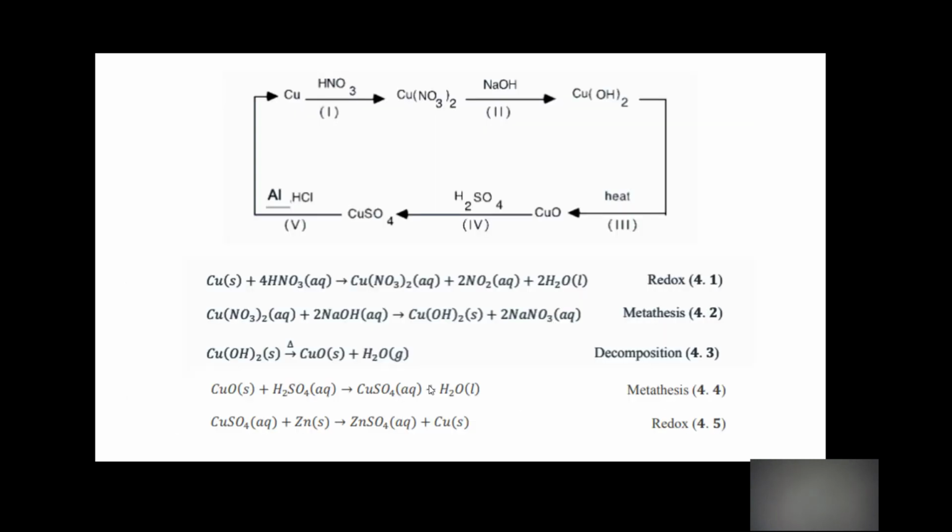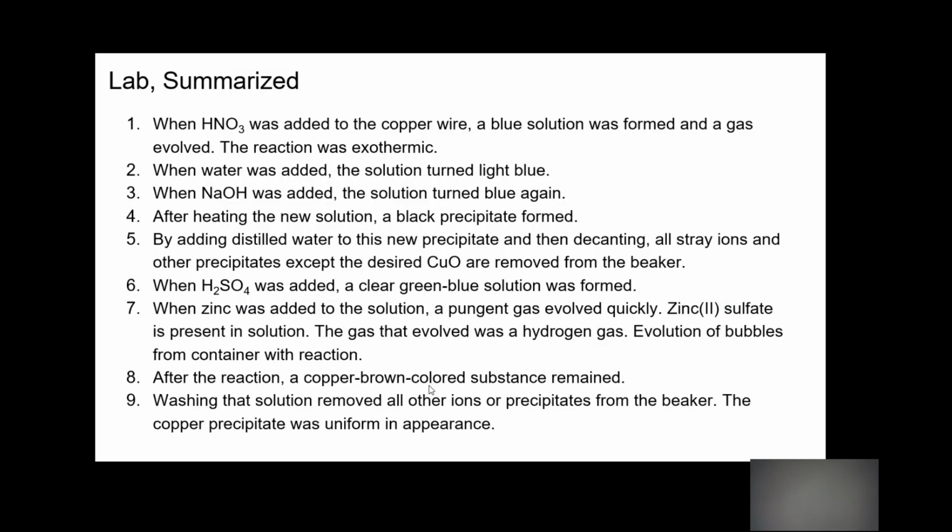This is where you step in and you have to really pay attention to all the wording and the reading to make sure that you understand what the reading is. And if you then can compare it to this and see if it matches up with what you're understanding.